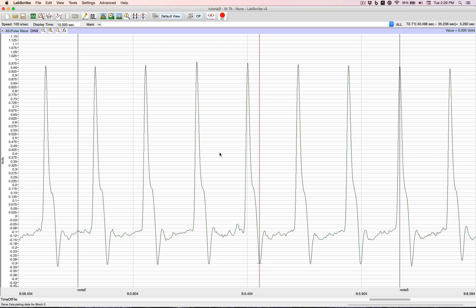In this tutorial, we're going to discuss changing the display time. After you've made a recording, perhaps you'd like to look at your data in a different way.